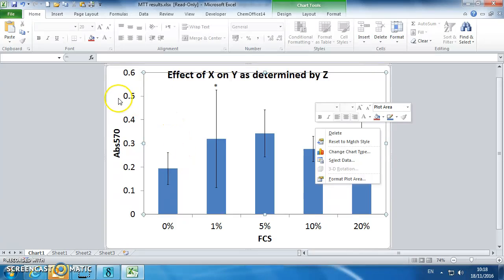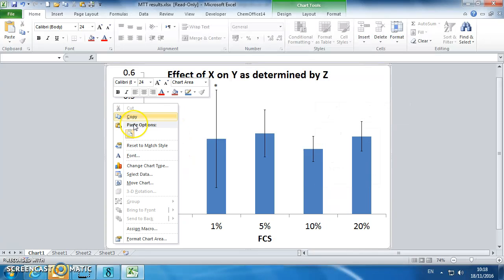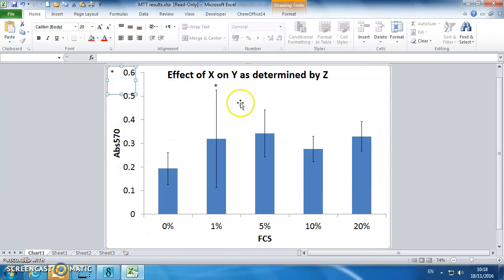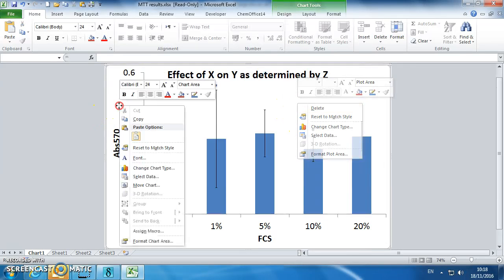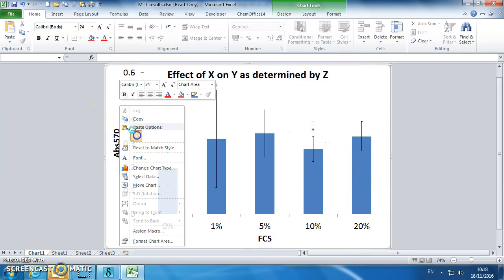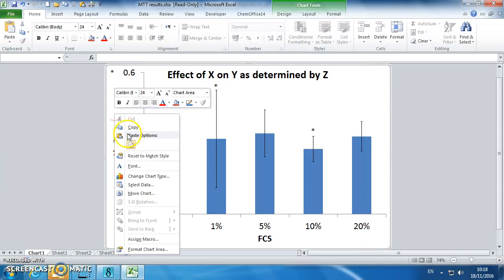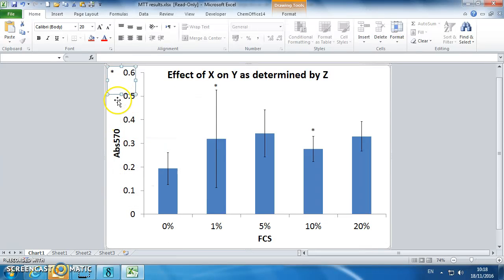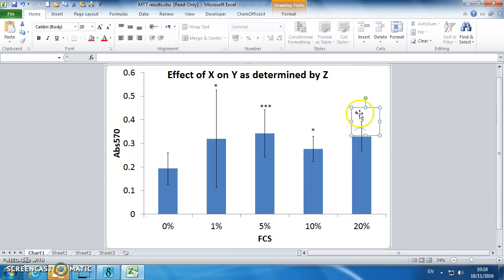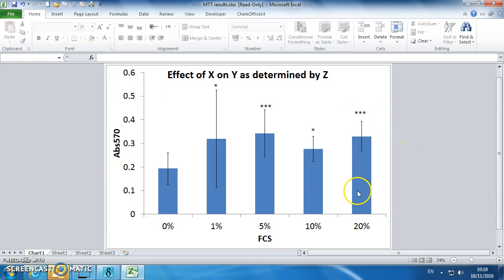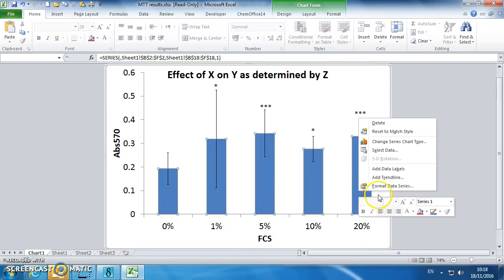I'm just copying and pasting that. So this one was 3 stars, and this one was 3 stars. And then you've got a very nice looking graph.